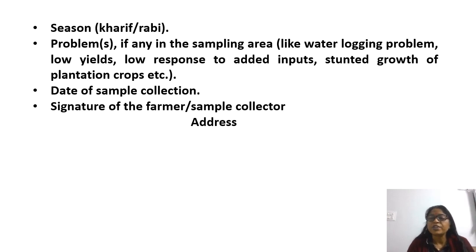So I hope you have understood the very first step of soil testing. That is, how to give the proper naming for it.